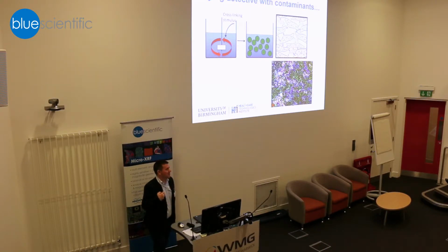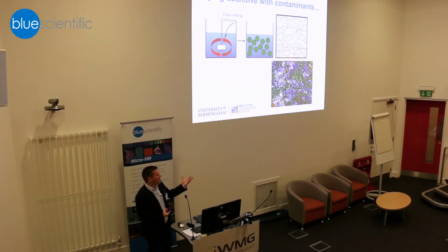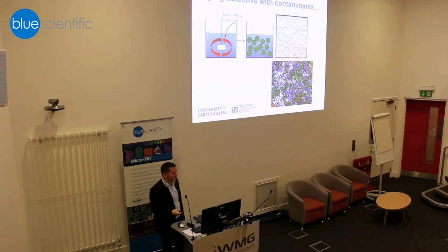What's the significance of using mapping to do this rather than any other technique? Well, if we look back at the way we make our eye drop, it is made essentially by making a colloid of polymer and then subjecting that polymer to quite high shear such that your polymer chains, which are floating in solution, crumple up into gel particulates. So all the cross-linking agents are enveloped within those particulates.